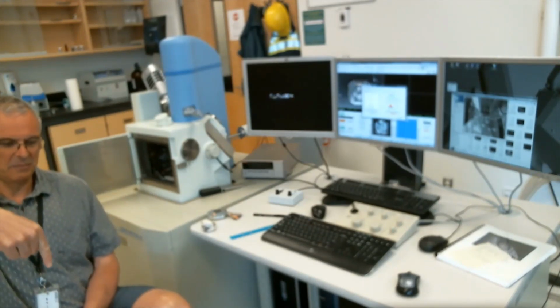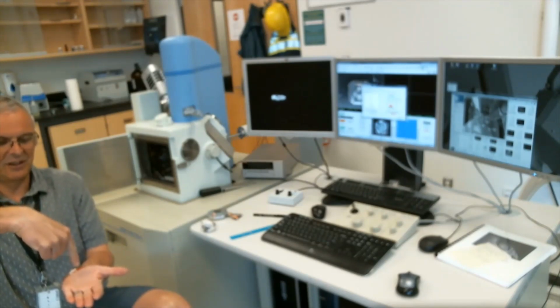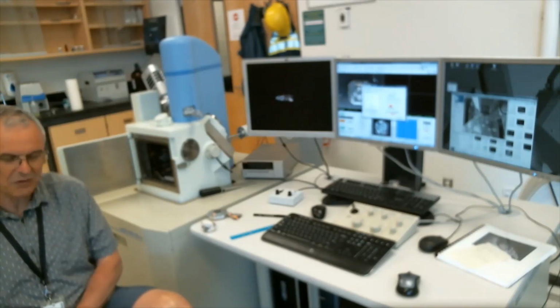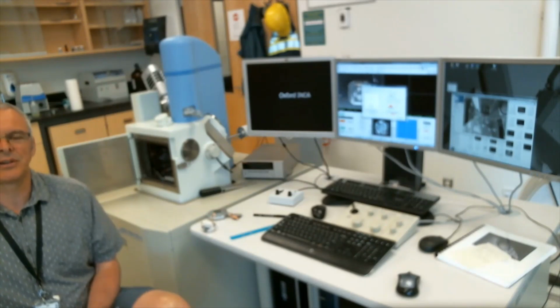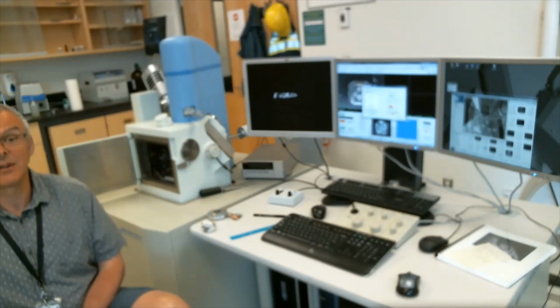So we have an electron beam coming down, trying to hit the sample, but it sees a big negative charge and it's going to want to scoot off to the side to avoid that negative charge, which is not good for stable imaging. So what we often need to do with electron microscopes, and previously that was the only choice you had, was to carbon coat or to coat your sample with a thin film of a conductor like carbon or gold, which is nice if you can do it.